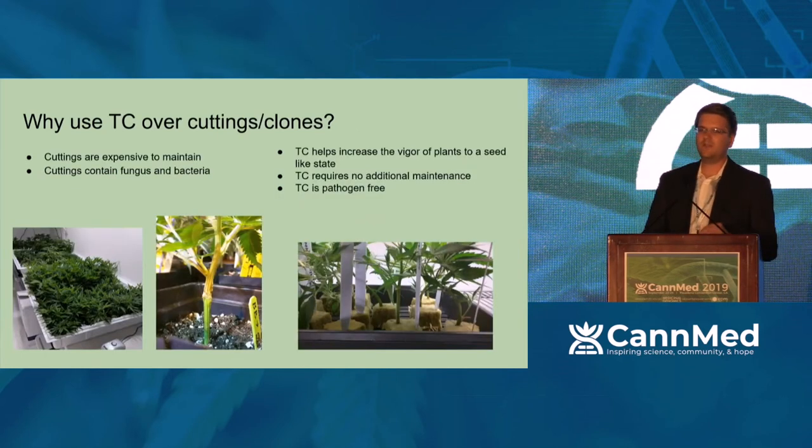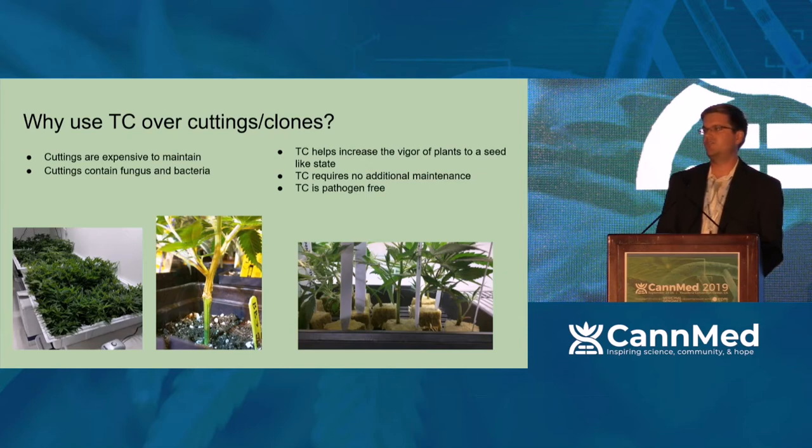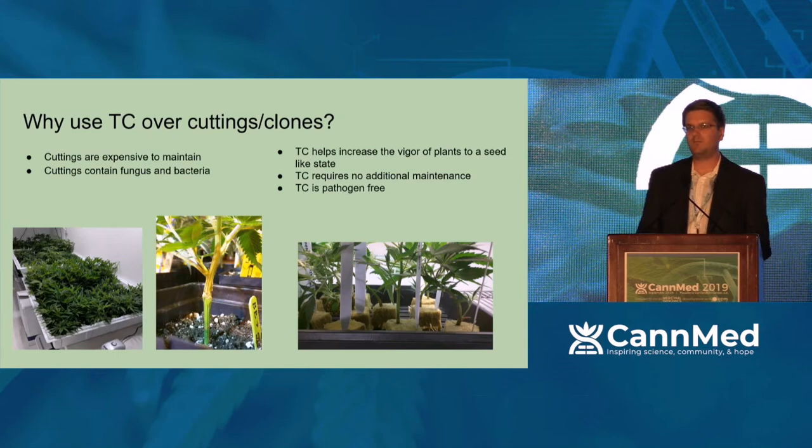So why do we use tissue culture over cuttings or traditional cloning methods? I guess the biggest one is tissue culture doesn't require maintenance once it's in the tube. You let it sit there and it grows. That means you don't have to water it, you don't have to look at it every day, it just sits there. I've had these cultures stay alive for up to 9 months at a time without having to touch them whatsoever under just normal room temperature conditions. And a lot of them will die off by that point, but at the same time, it's good to know that you can keep them in tubes.